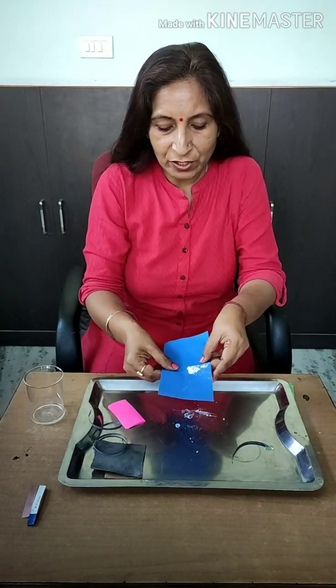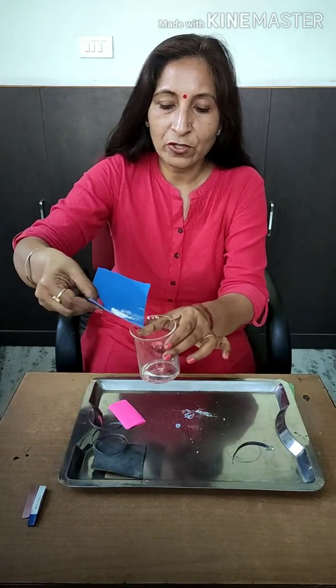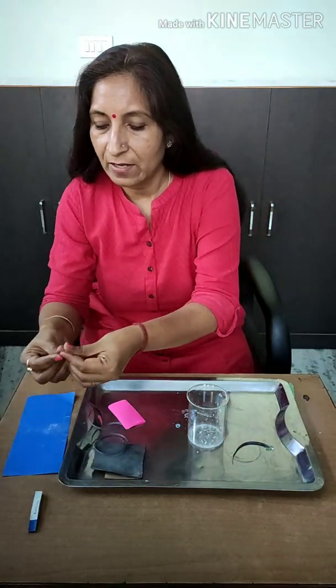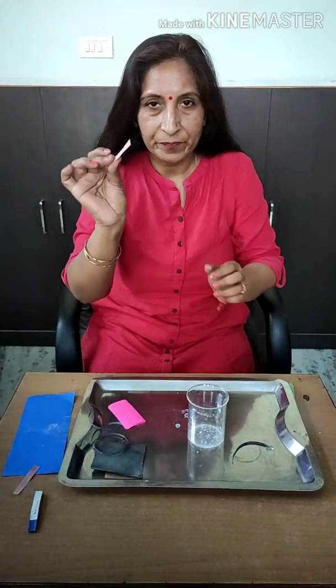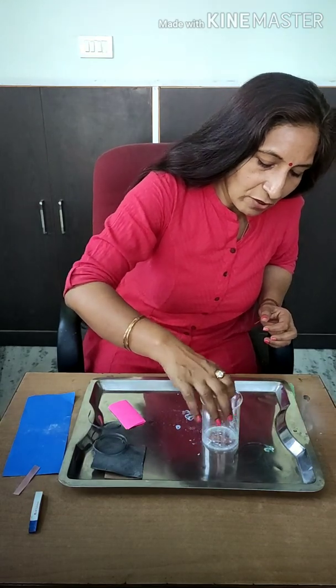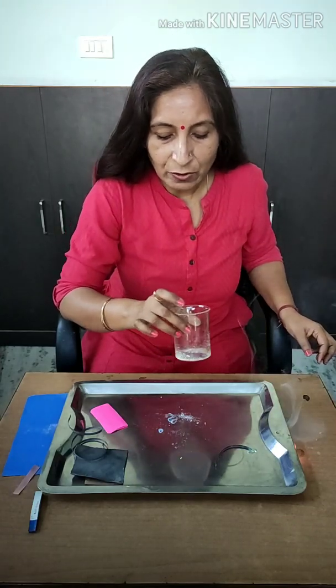Now let us check its nature — whether it is acidic or basic. For that I am adding it in a little amount of pure water. I am shaking it a little, and to check its nature I am taking a red litmus paper and putting it in this solution. After some time I will take it out and observe whether it turns blue or not.